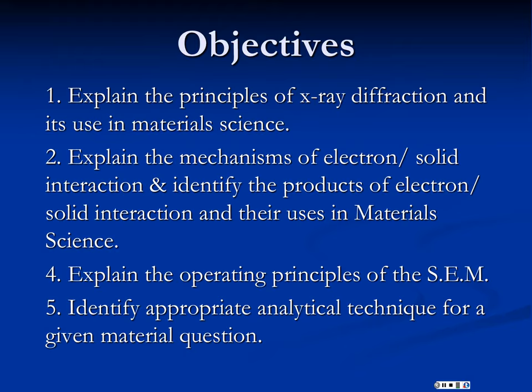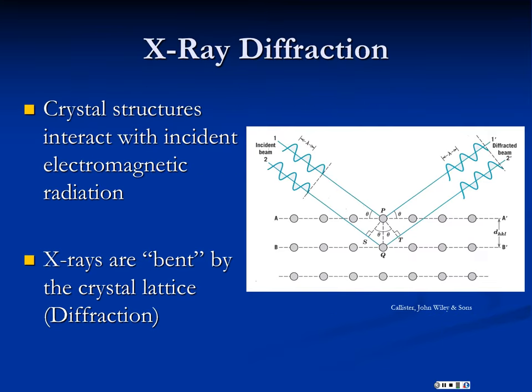We're going to cover some of the most commonly used tools for the materials engineer, at least the mechanically oriented materials engineer. We're going to look at how the electron microscope works, the scanning electron microscope in particular, and also the transmission electron microscope. And then my expectation for you is that you're going to be able to identify how to answer given materials questions. The answer is not always use the microscope, and you need to be able to identify the proper tool.